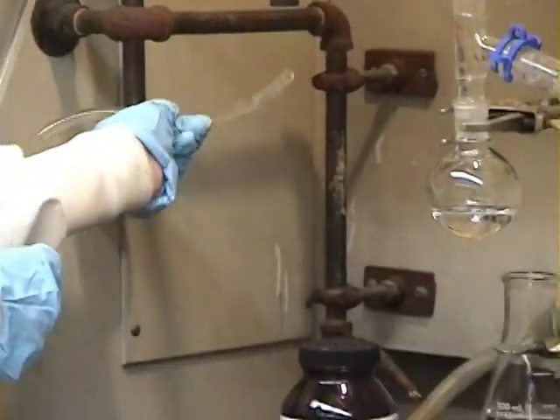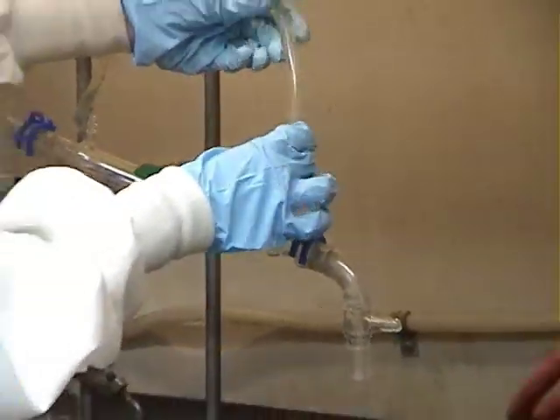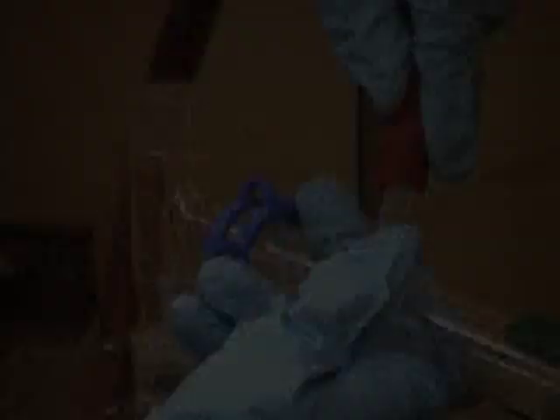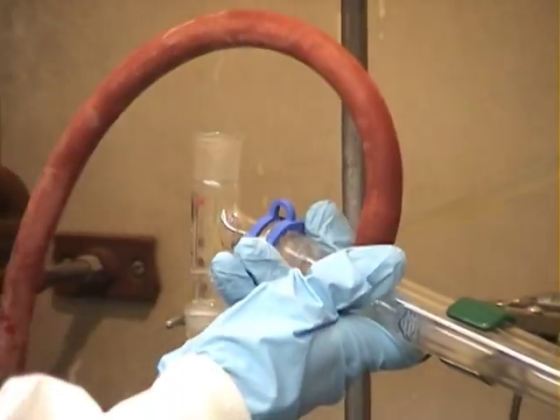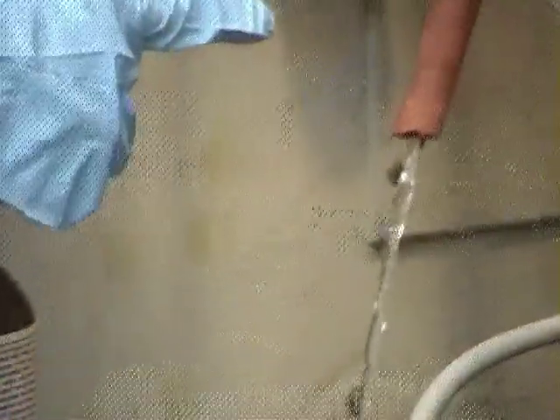Attach the hoses to the condenser. The hose attached to the water is connected to the lower opening of the condenser, and the spare hose is attached to the upper opening of the condenser and directed to flow into the sink. When done correctly, water should flow up the condenser and into the sink.